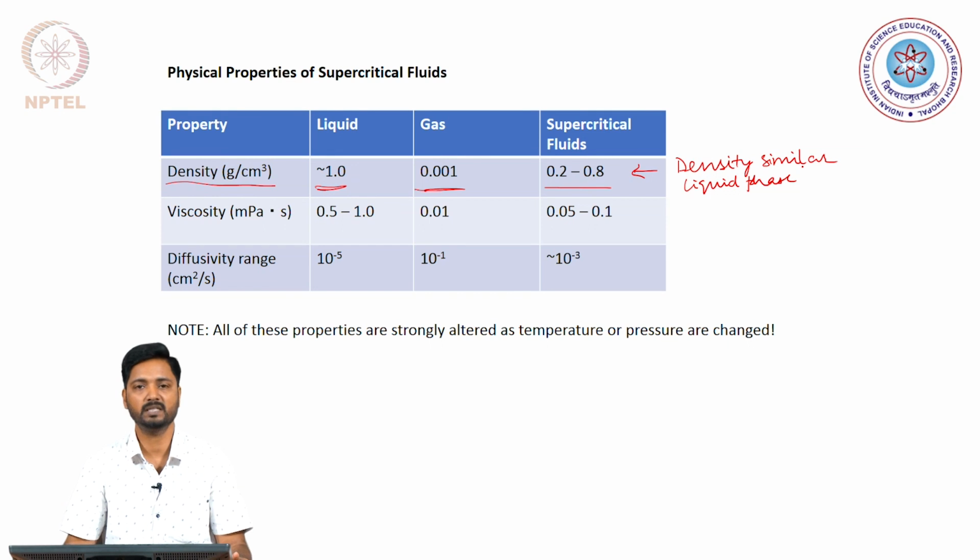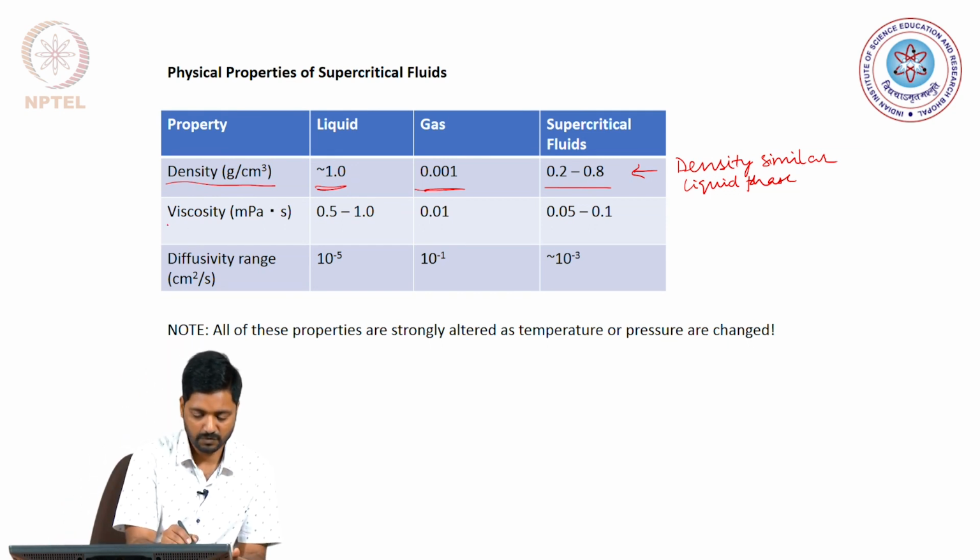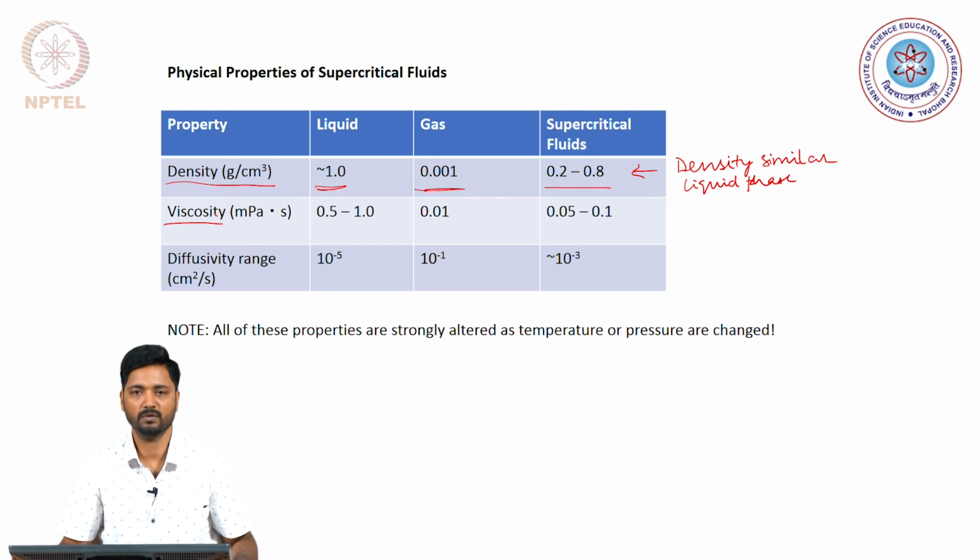The other parameter that is of interest to us is the viscosity of the medium or the fluid phase, and as we have already seen, the viscosity clearly influences the various diffusion terms or the resistance to mass transfer terms. So, we would want viscosity to be intermediate, because another challenge that viscosity brings is that it reduces the flow of the mobile phase through the column and creates greater back pressures.